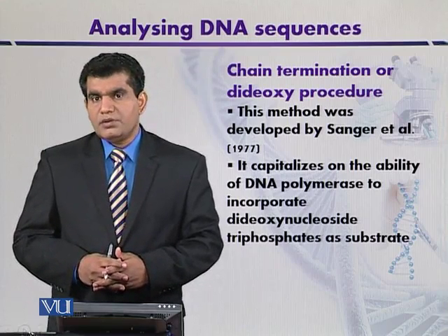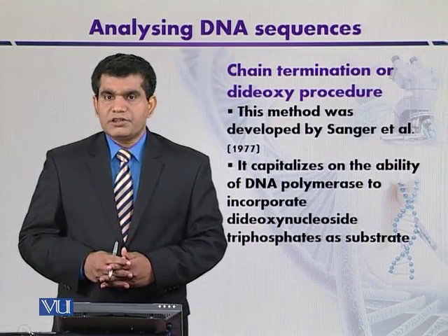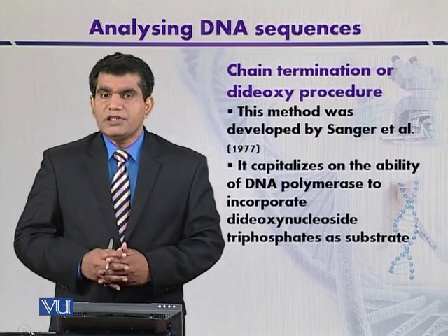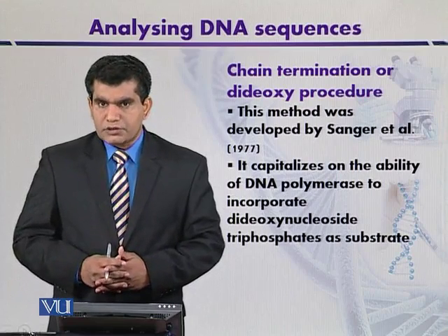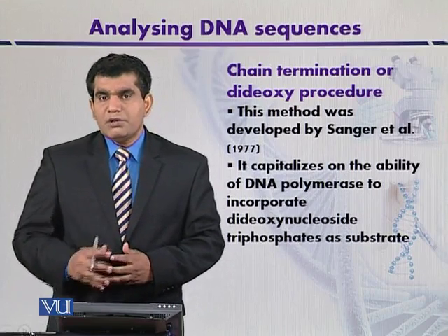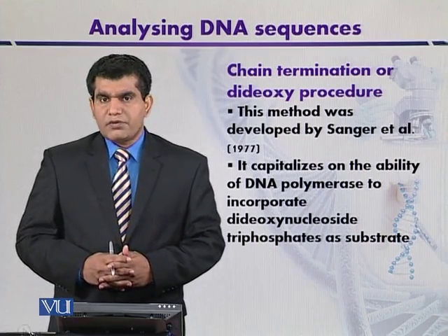Here, during the sequencing process, we rely on two capabilities of DNA polymerase. The first capability is that it can synthesize a faithful copy of the single-stranded DNA template, so that a second strand of the DNA is produced. The second ability is that, in addition to normal bases, it can also introduce dideoxynucleoside triphosphate.